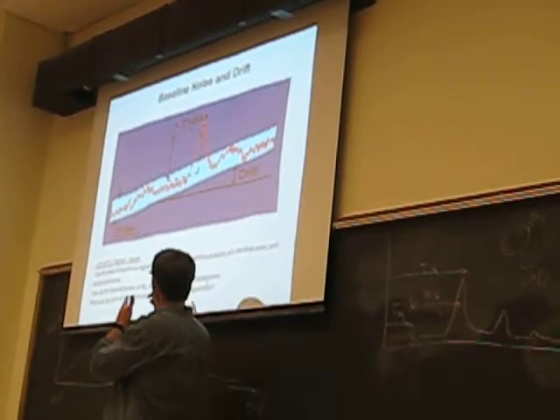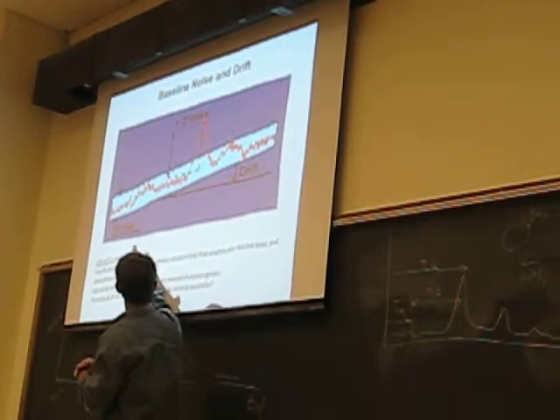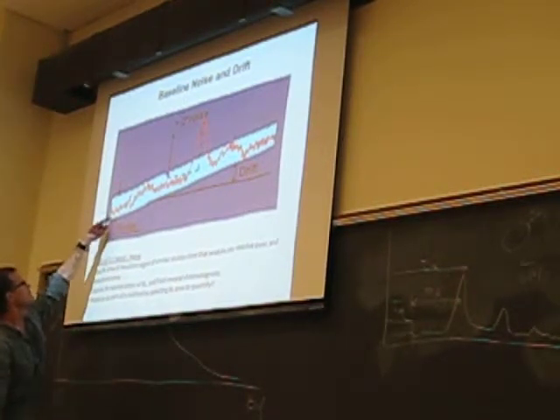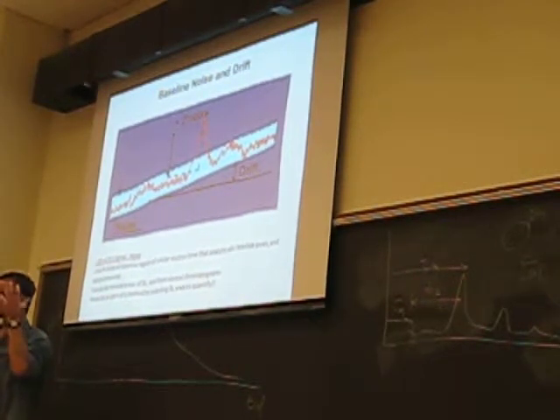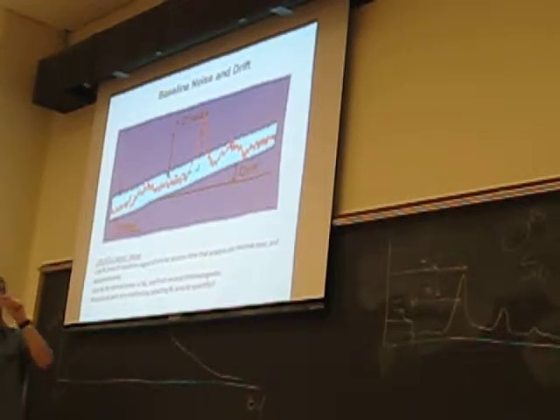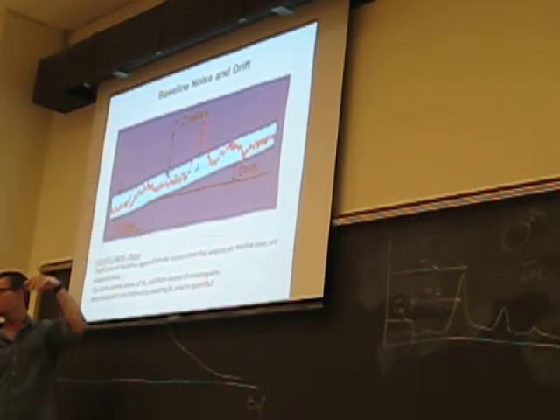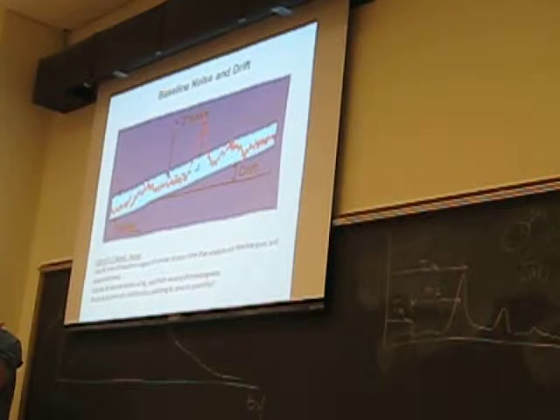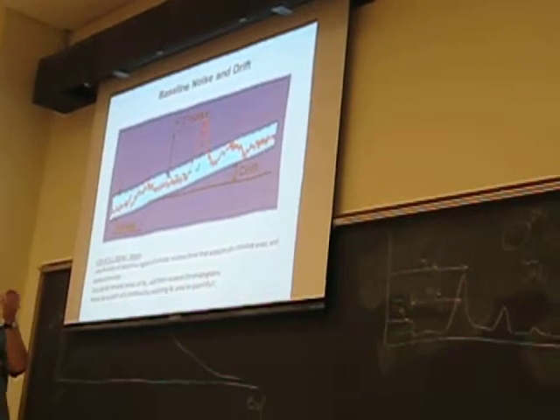And so if you were to blow up what that noise might look like in terms of a baseline, in real time, so this is over time here, you'd see this electronic noise that is generated at the point of the detector that in some cases may limit our ability to distinguish what is a real response versus what is just background noise. And that's what you're using to determine the detection limit of your instrument, right? How noisy is the instrument detection compared to the measurement of the true analog signal.